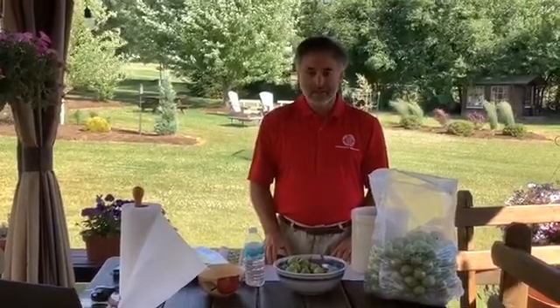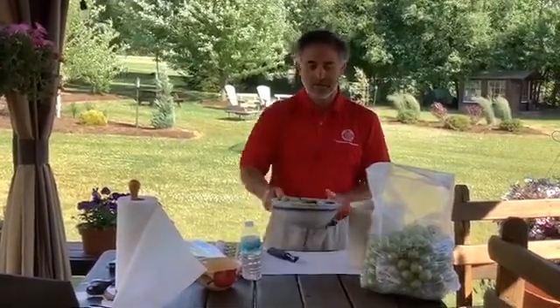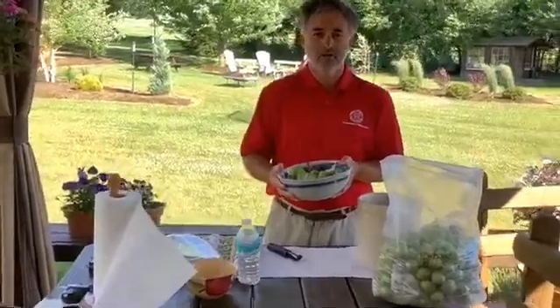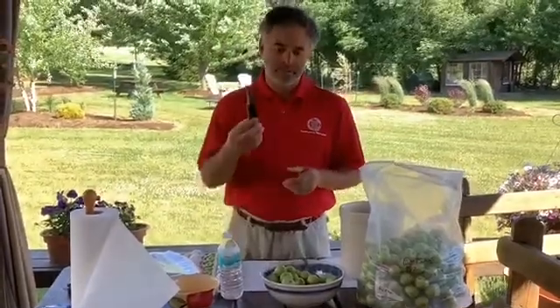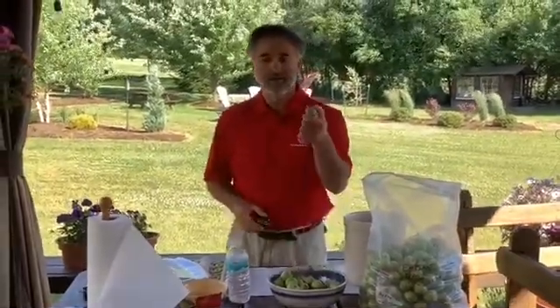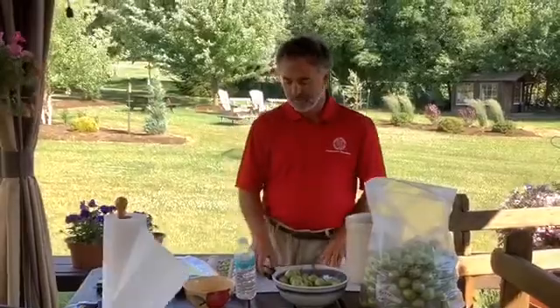Afternoon. I want to show you how to collect Honeycrisp fruitlets for Peel SAP analysis, and how we're going to peel these fruitlets this year in July.